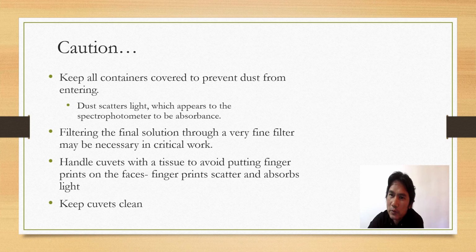so caution: keep all containers covered to prevent dust from entering. Dust scatters the light, so make sure that when you operate the spectrophotometer, the room must be free from dust, because dust scatters light, which appears to the spectrophotometer to be absorbance.